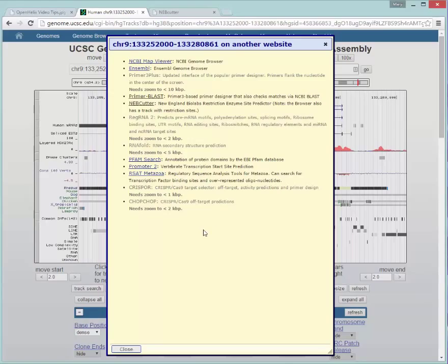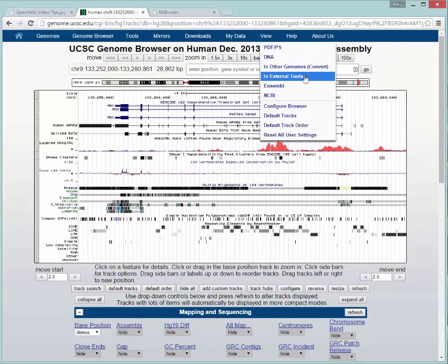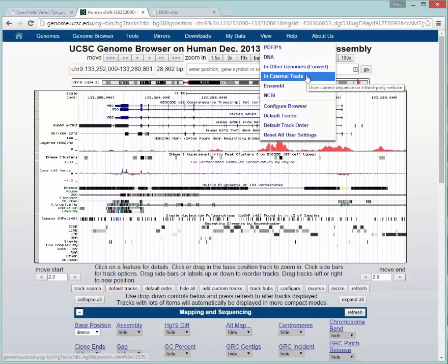Why don't you try it out? Go to the UCSC Genome Browser, open that menu, once again the View in External Tools menu, and try these out.